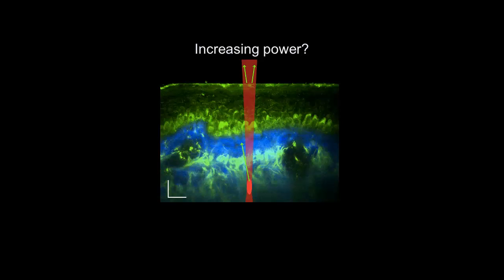Yeah, Tom? You mentioned earlier that collagen has autofluorescence. So can you get both a second harmonic generation and a two-photon signal from collagen? Yeah, for particular wavelengths. You get more fluorescence as you tune the wavelength lower than 800 nanometers. Above 800 nanometers, you don't get much fluorescence from collagen, but you do for wavelengths such as 760 and 780. We have a nice publication on that.